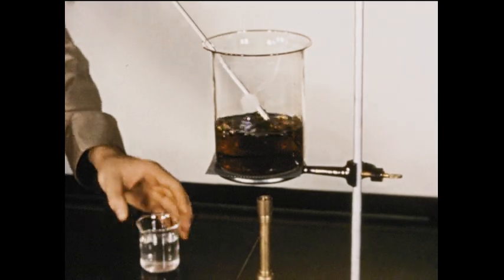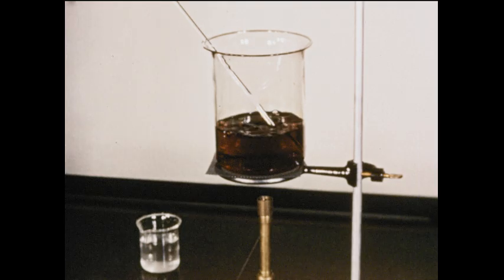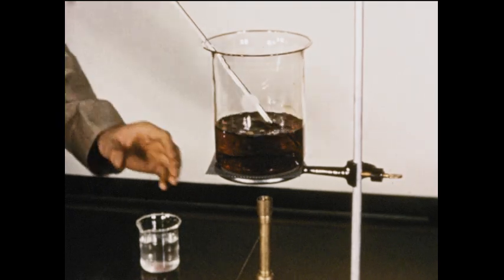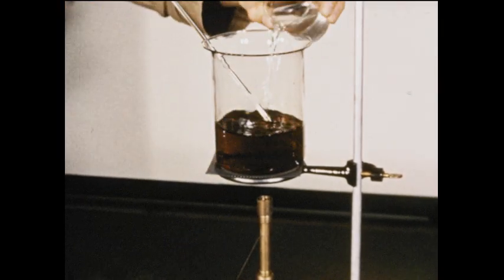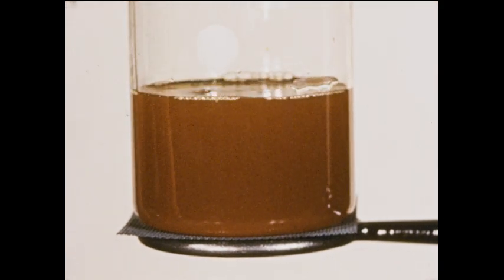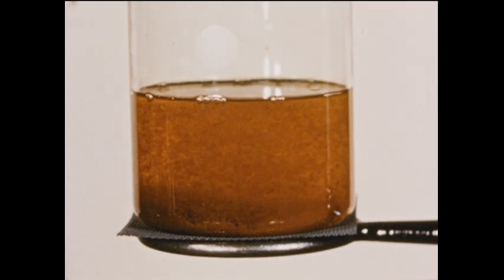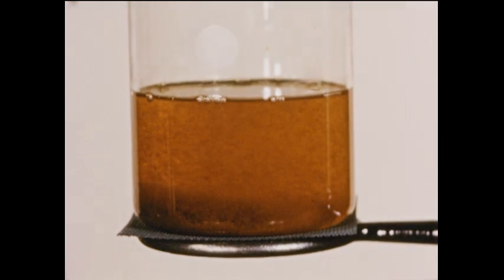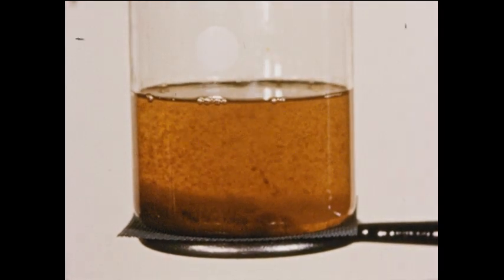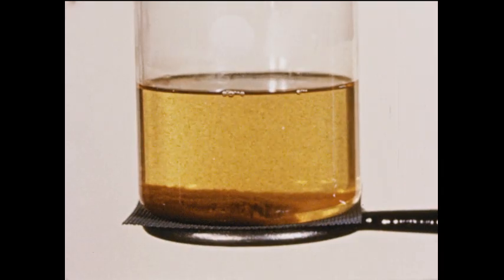One way to do this is to add an electrolyte to the colloidal dispersion. Negatively charged ions in this electrolyte will be adsorbed by the colloidal particles and neutralize their charges. Watch what happens as we neutralize the positive charges on the colloidal particles. As the particles are neutralized, they clump together or coalesce and begin to precipitate out. So it is possible to destroy a colloid chemically. Later we'll see what value this has.